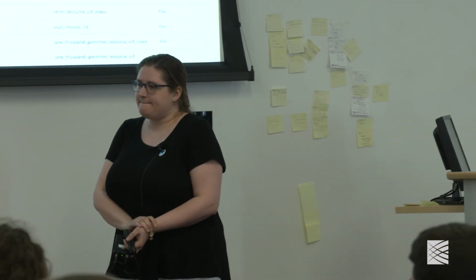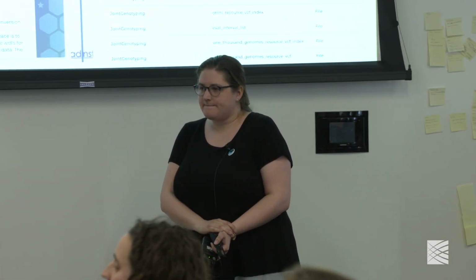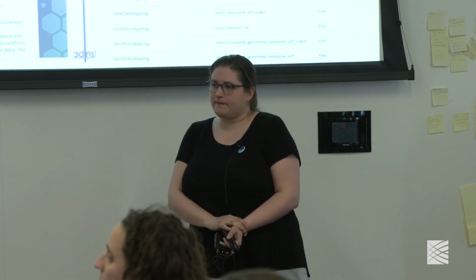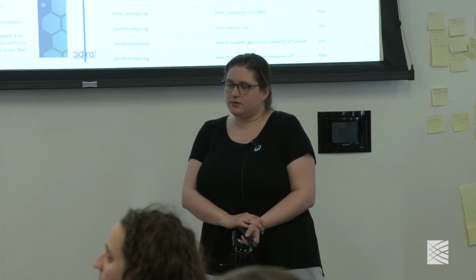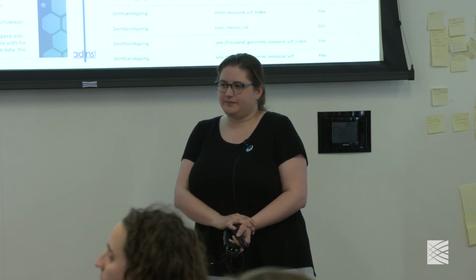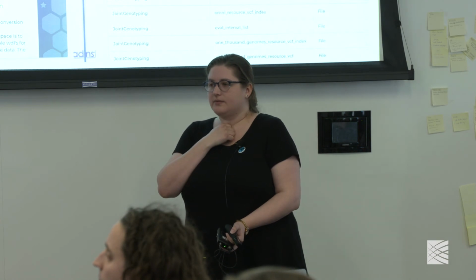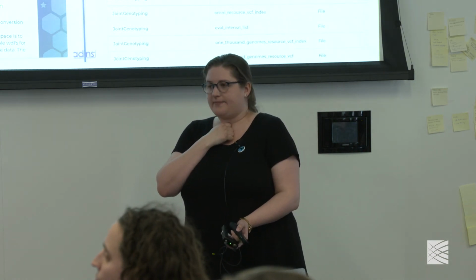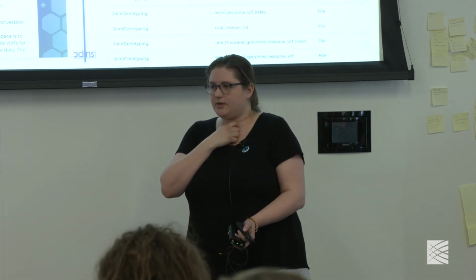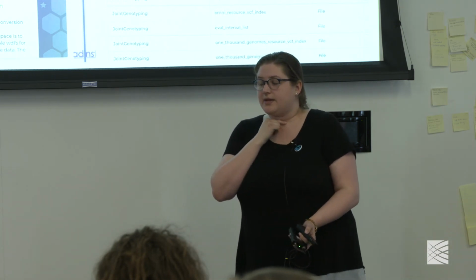So in pediatric oncology, a lot of times we'll sequence the tumor and we find mutations and we want to know whether they're in the germline. So we also have the germline, and it's been done clinically. But the variants have been called, obviously, with the germline pipeline rather than with the somatic pipeline. And how confident are we, if we're using two different pipelines, because that's what's clinically accepted, the somatic versus the germline, that the germline is going to find something that we found in the somatic caller if it isn't the germline?